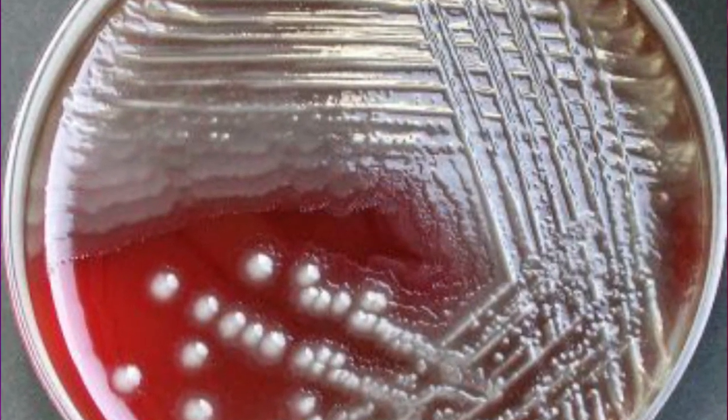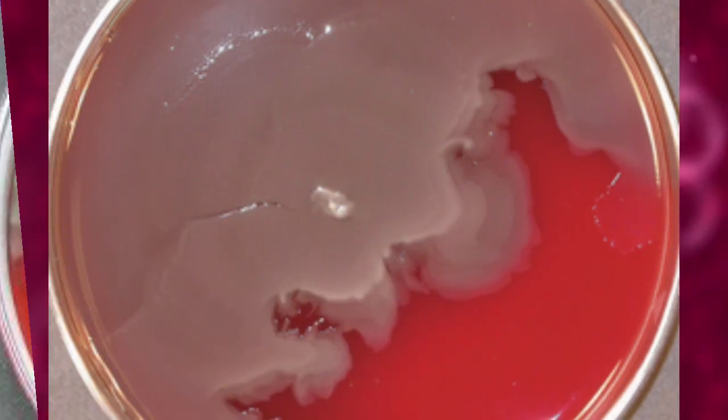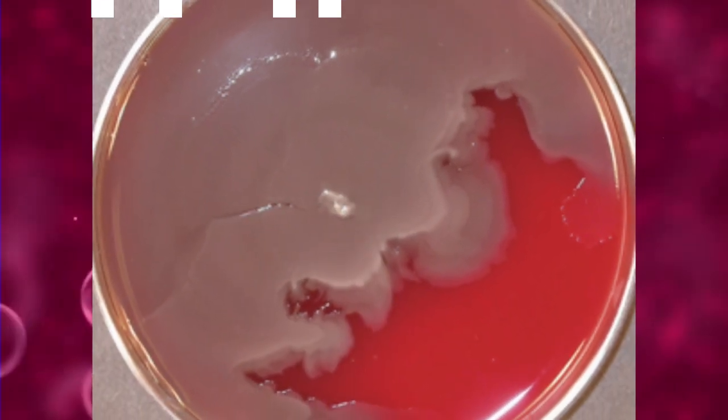Colonies of Proteus mirabilis swarm on non-selective agar media such as blood agar, producing a surface film.